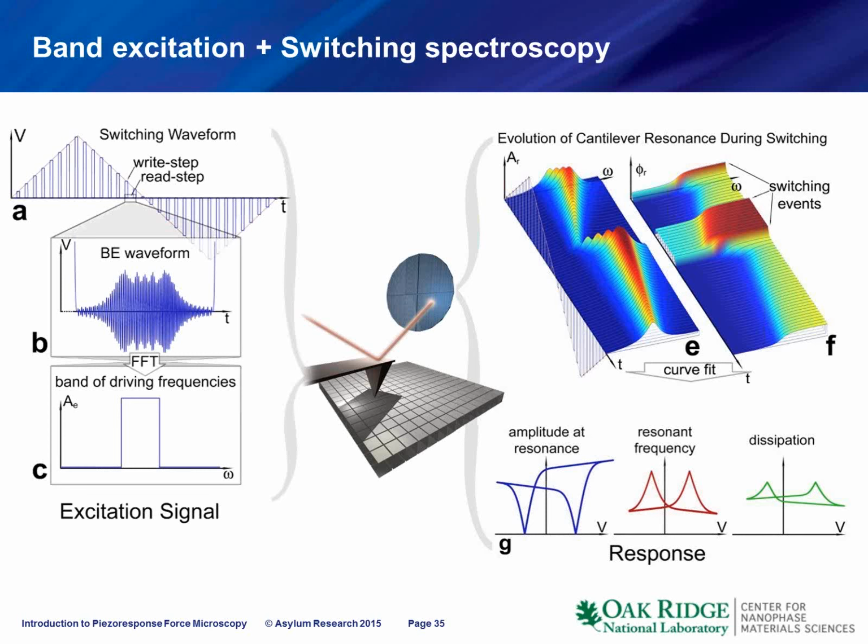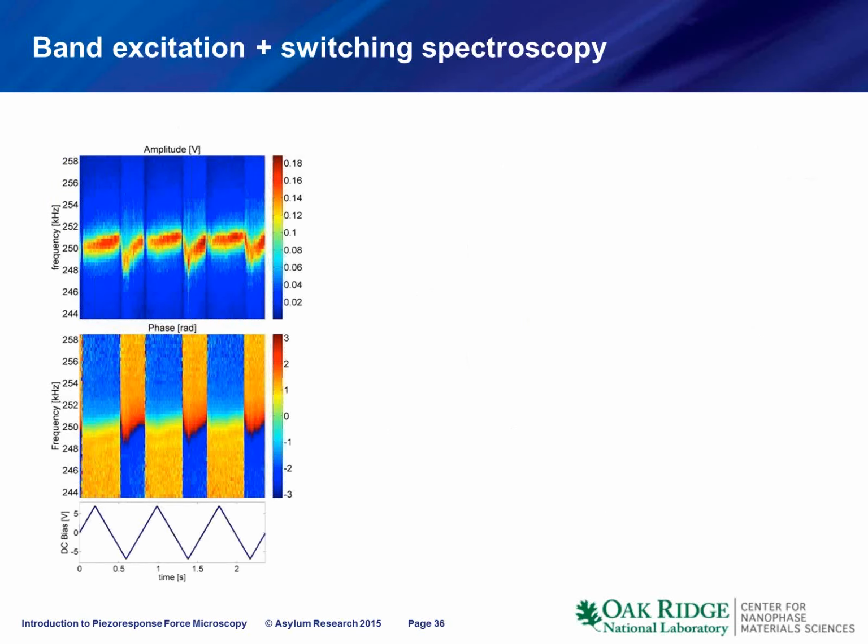These are materials which are really interesting because of their giant electromechanical responses and broad applicability in sonars or energy harvesting. So we'll talk about it in more detail in the follow-on seminar.